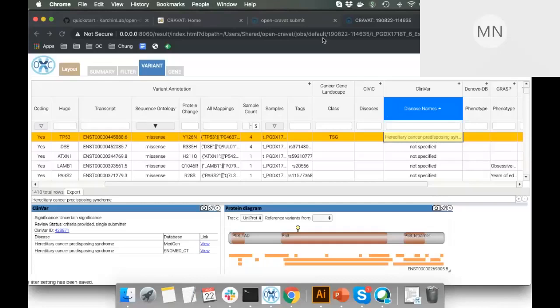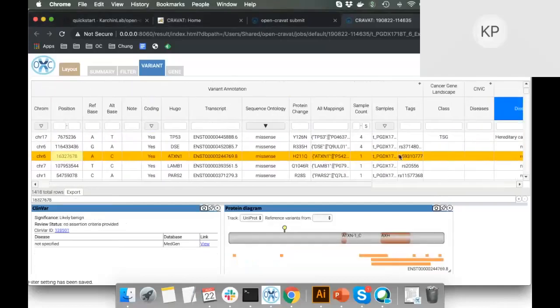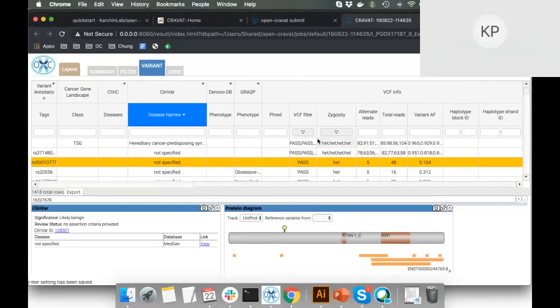Yeah, it'll be included as, I think, tags. I'm not exactly sure. Get into contact with me about this, and if we don't handle it well, we will add in functionality to handle it well, because that's an important component of it.